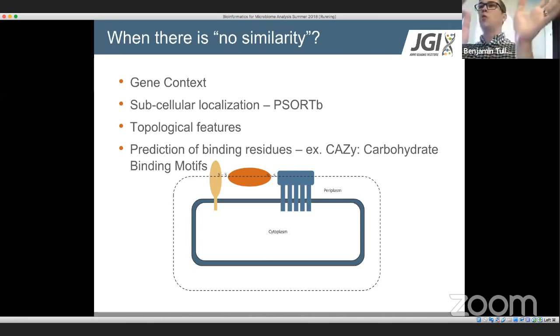And if what you're getting are matches to functionality in all 3 of those databases or all 5 of the databases that you're looking at, then you can be a little bit more confident that what is in there has not been misannotated. If you go into NCBI and you get one result and it tells you that it's a reductase of some kind, and then you get into all these other databases and it's telling you that it's a transporter, that seems like there was an error in one of those cases. And you have to then make a decision based off of the efforts that you've put into this. Do you trust the multiple databases that have the same annotation?